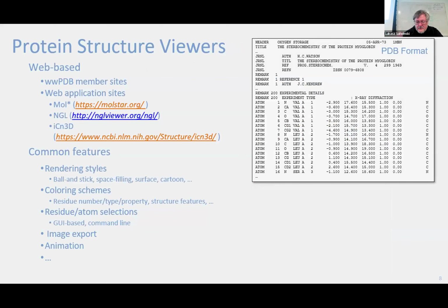This is once more a snippet of a PDB format. It's pretty old. It originates back in the late 60s, I think, or early 70s. At that time, computers were sort of ancient and used strange things for data input, namely those punch cards that go back to, I think, the 19th century. Those things had a limited number of characters that were able to fit on a card. So the PDB format has restrictions imposed because of that. It's only 80 or so characters wide, in the format.